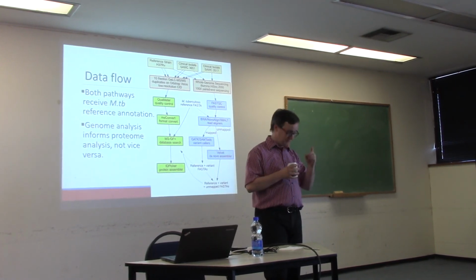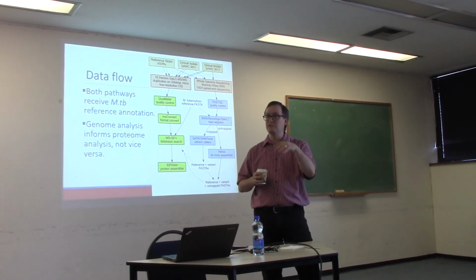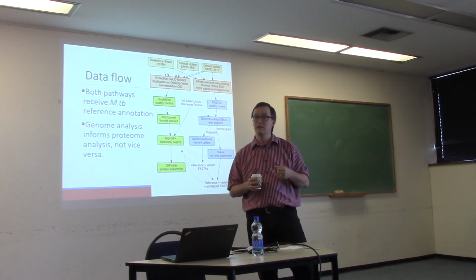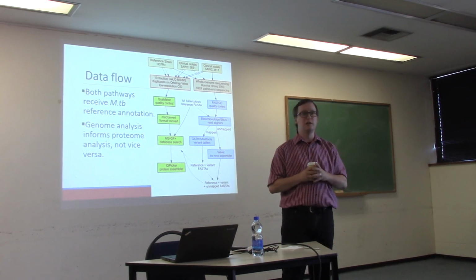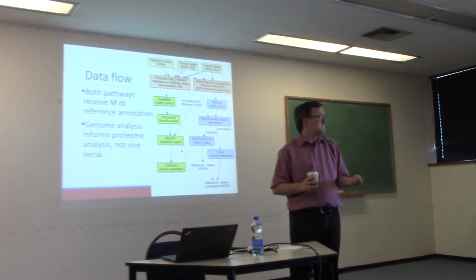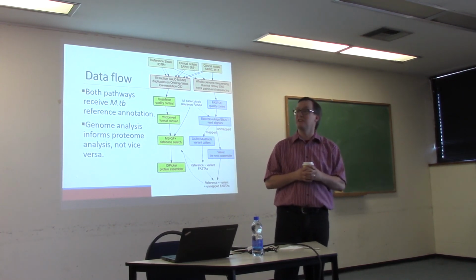The other possibility is that there's gold in those hills. So it could be that we are not using the post-translational modifications in our searches that correspond with that particular peptide. We could lose it that way. We could lose it because we didn't have the right peptide sequence in our database. So if, for example, I'm working with sputum from someone's lungs, and I include MTB and I include human in my database, any other respiratory infection they might have would produce a peptide that I can't identify because it's not included in my database. So there are contrasting ideas about it.